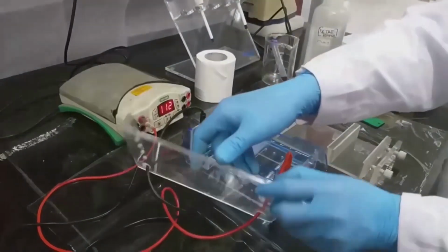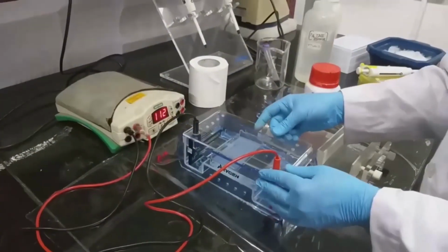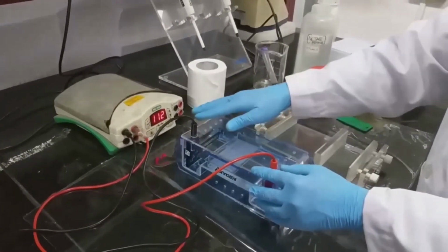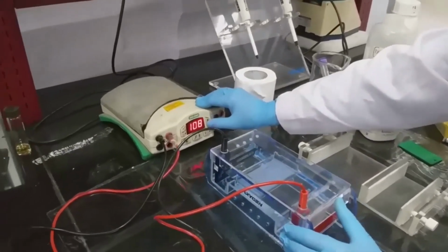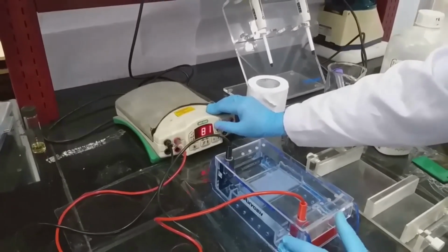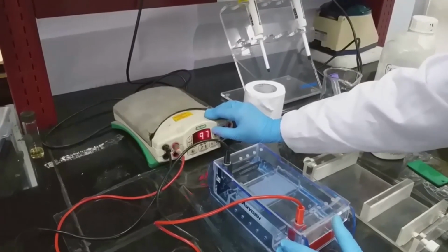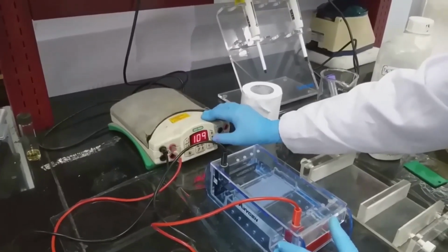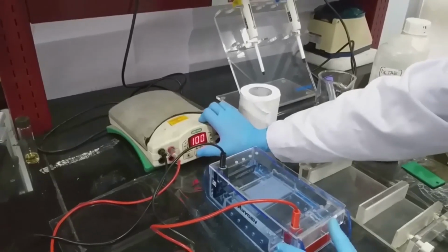The loading is over. We have to cover the electrophoretic apparatus with the lid and we have to adjust the voltage. Then start run.